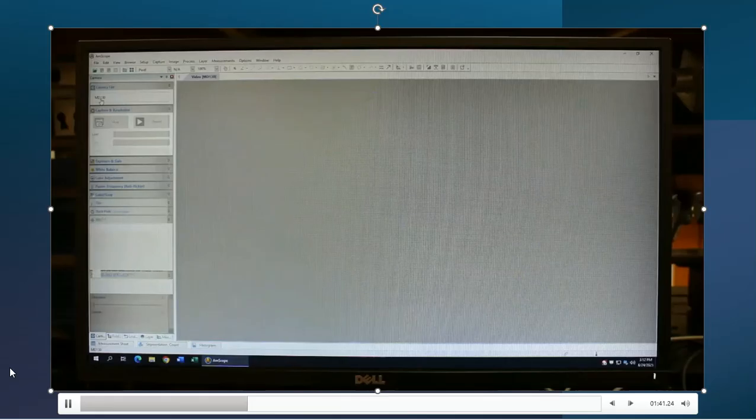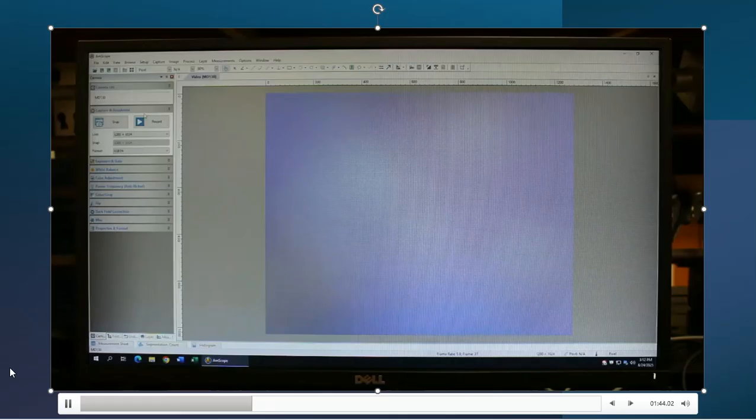And there we go. I'm going to see just a couple of seconds of a little bit of movement, things that are going on, and I don't really see an image. I don't see anything nice and pretty. That's because I've not focused the microscope. So now what I'm going to have to do is go to the microscope and grab a hold of those platform dials and lower that platform down or up and fine adjust it. If my image is not directly underneath the lens, I'm also going to have to move the platform left, right, or forward and backward. I get movement in all 6 directions here. All right, so that's going to be my next step.